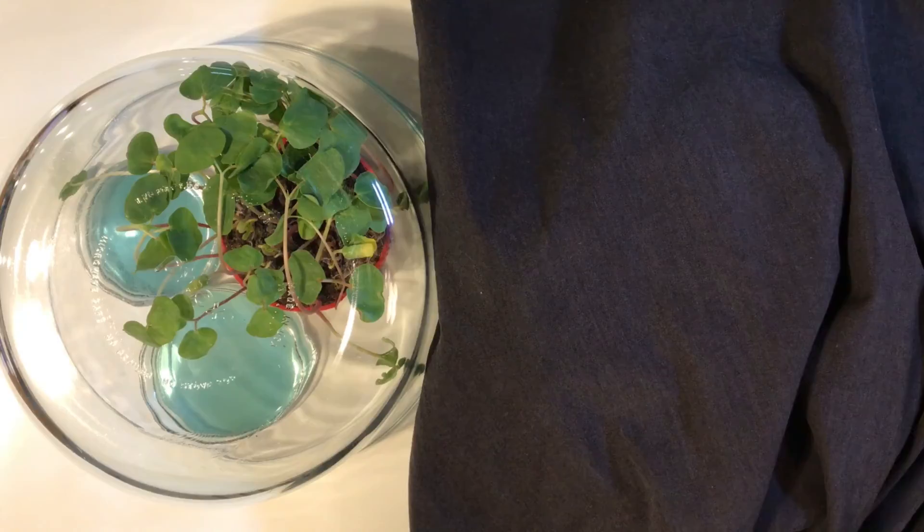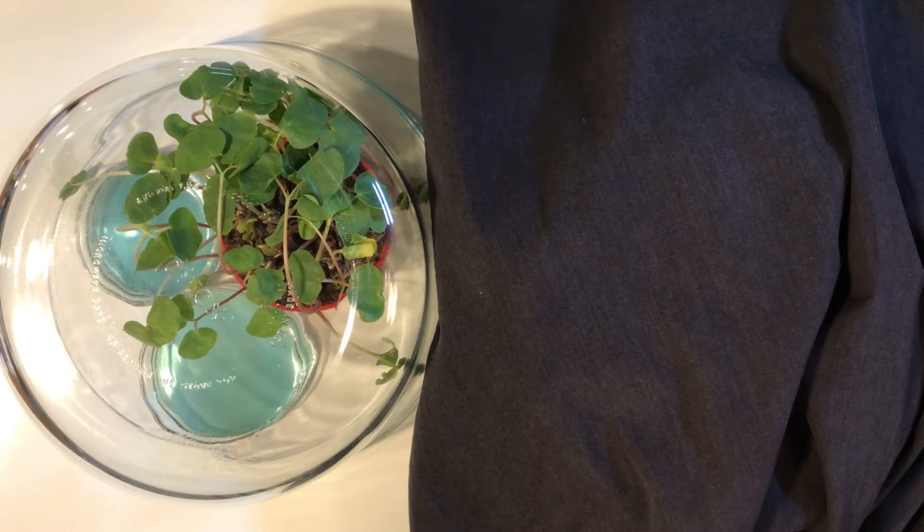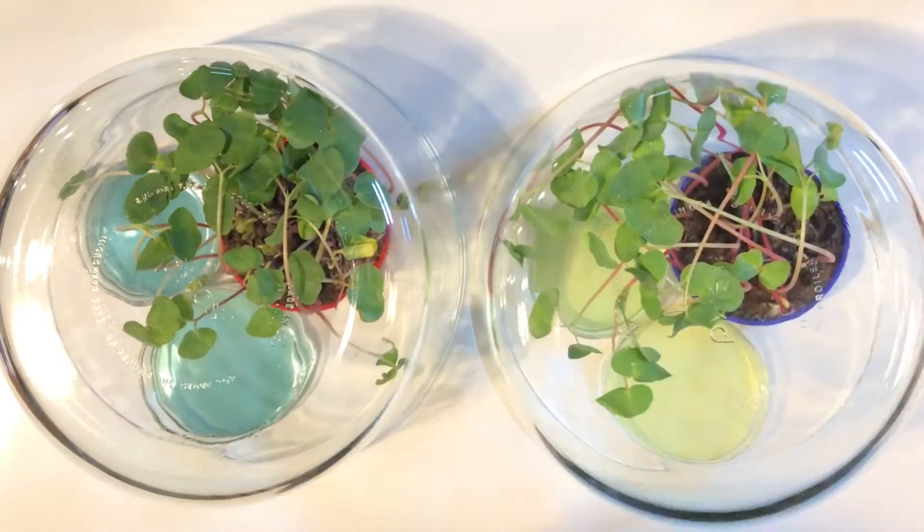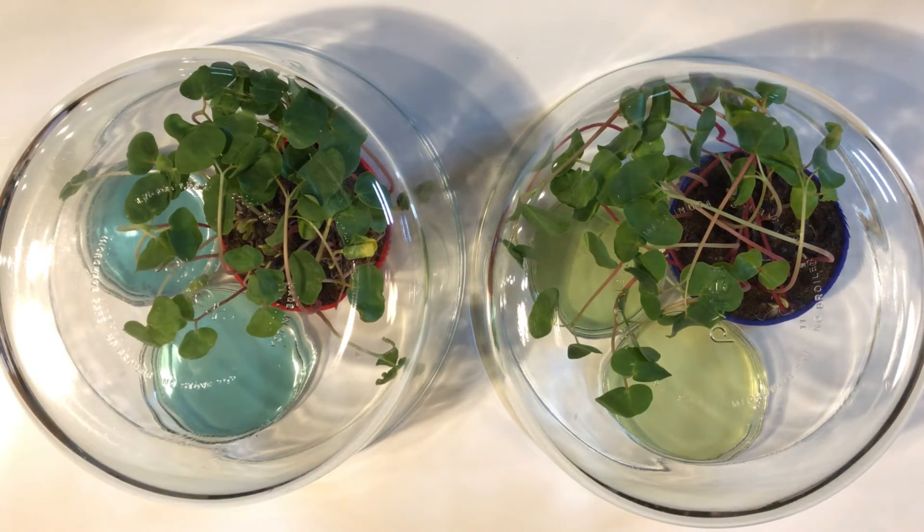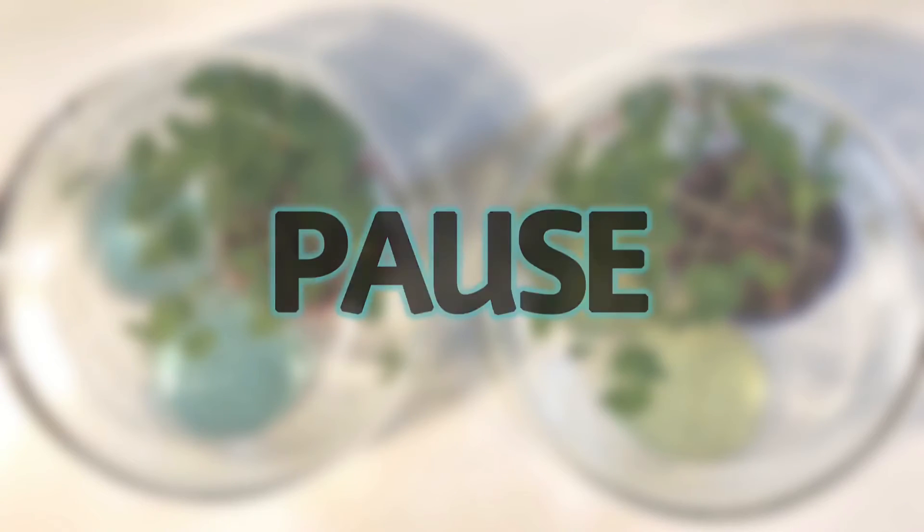So let's look at our results. The plants that were exposed to light turned the yellow BTB more greenish. The plants in the dark seem to have done the opposite and turned the greenish BTB yellow. At this point, go ahead and pause the video and see if you can figure out what these results mean.